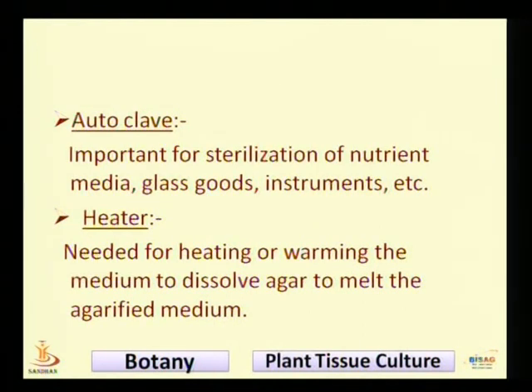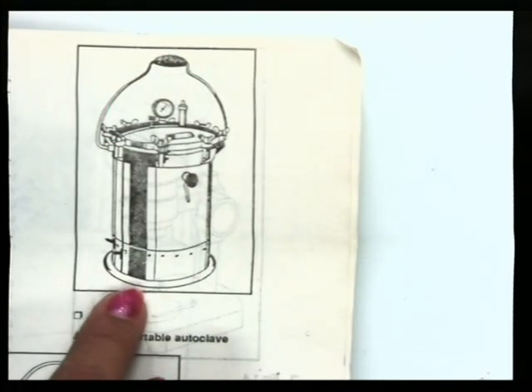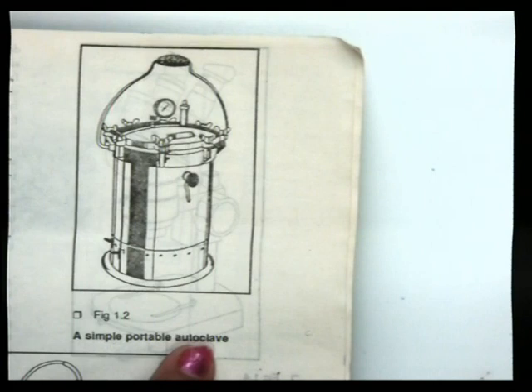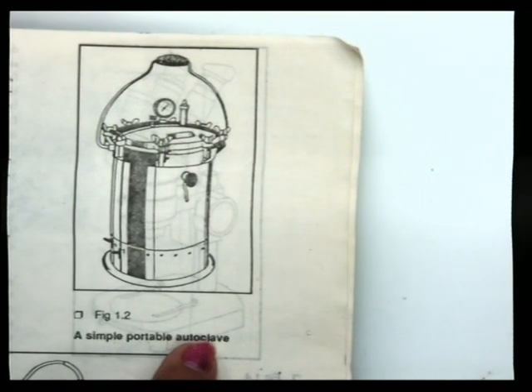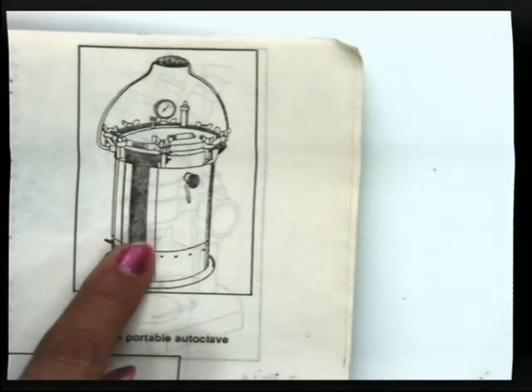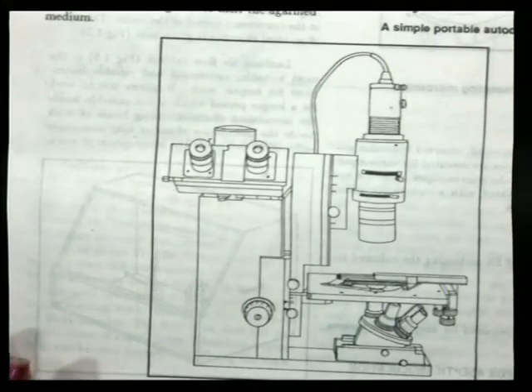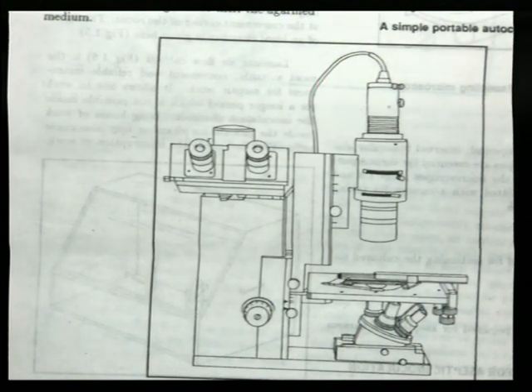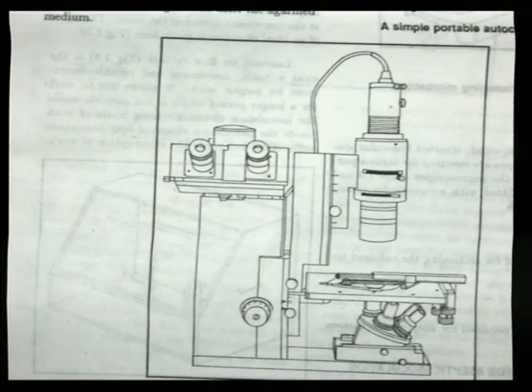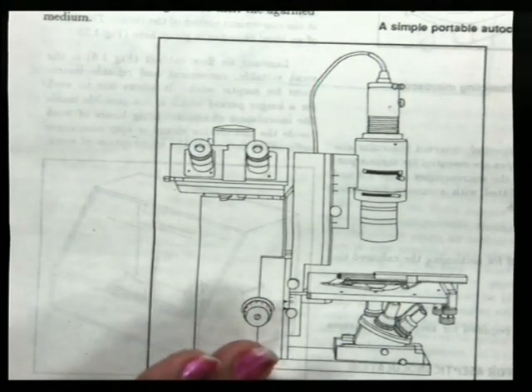The autoclave is an instrument we operate ourselves — it works just like a pressure cooker, which we have in our tissue culture laboratory. The autoclave is important for the sterilization of nutrient media, glassware, and instruments.